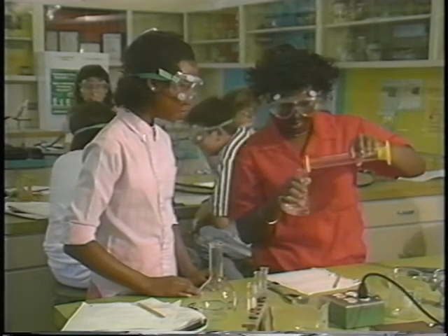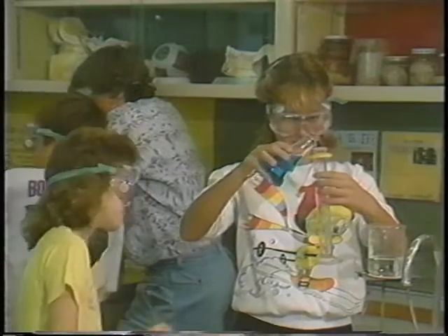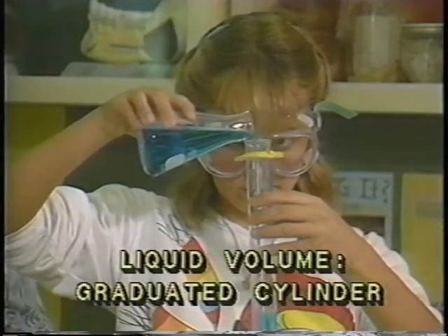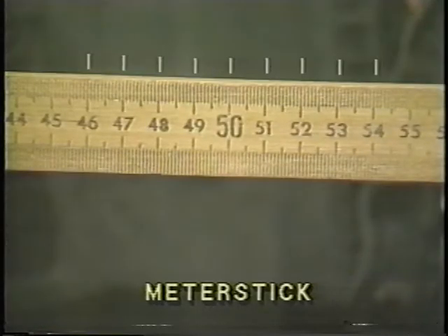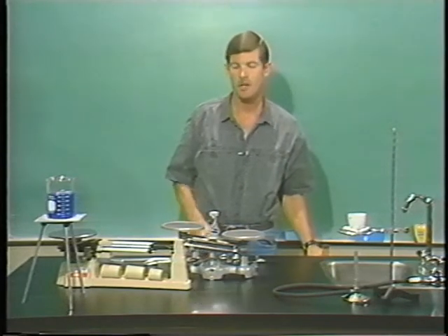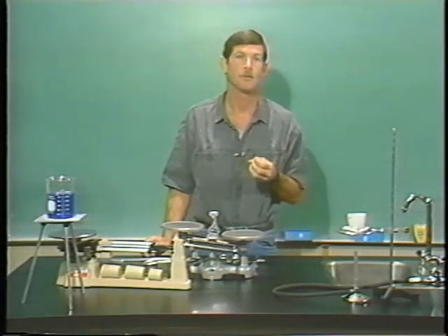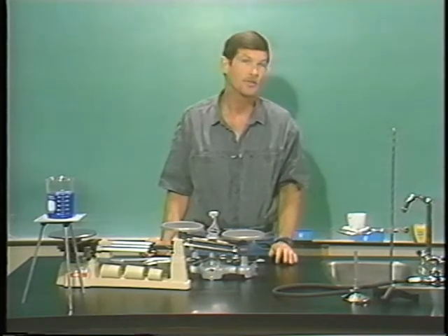Let's take a look at some more science equipment. When we make measurements, three of the basic things that we try and find out are volume, length, and weight. Whenever we measure volume, particularly liquid volume, the instrument we use is the graduated cylinder. When we measure length, the instrument that we use is not the yardstick, but rather the meter stick, and you can see that it's subdivided into centimeters and millimeters. When we measure mass, which is sometimes confused with weight, we'll be using a piece of equipment called a balance. Instead of weighing the object, we will be massing the object. And that mass is recorded in metric units called grams.